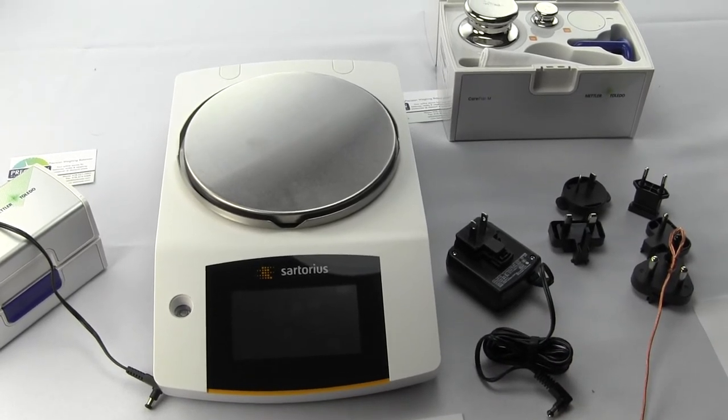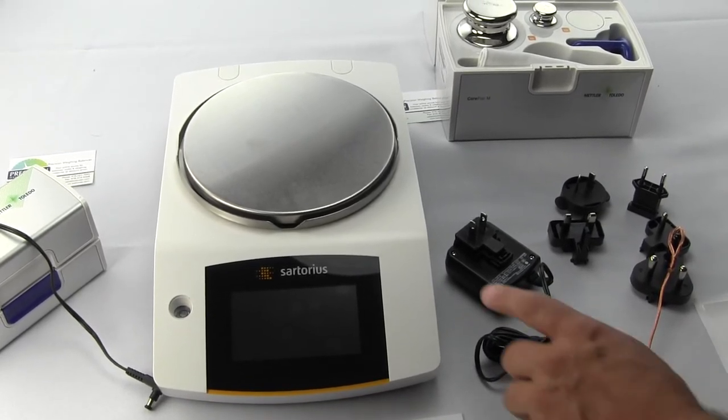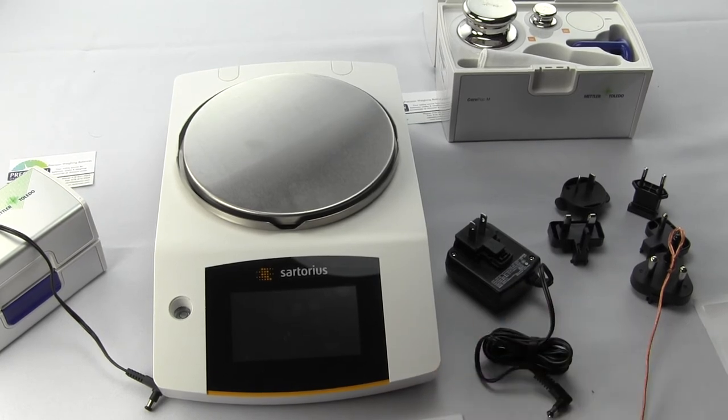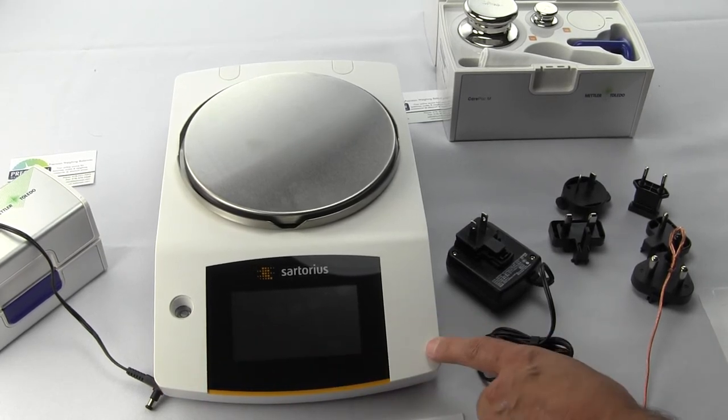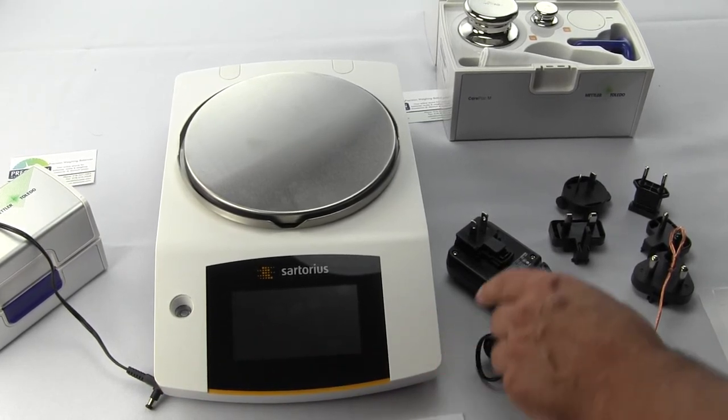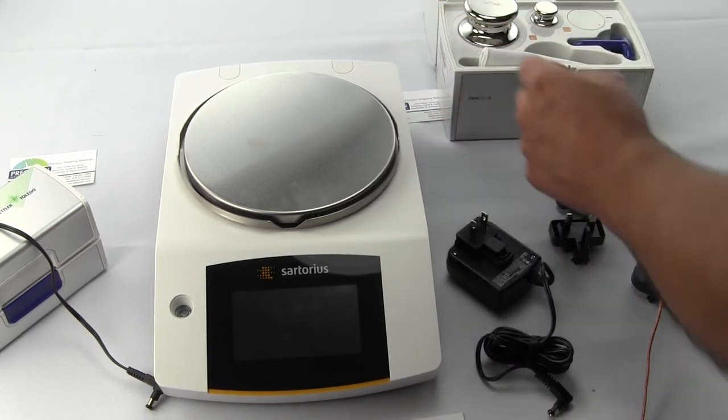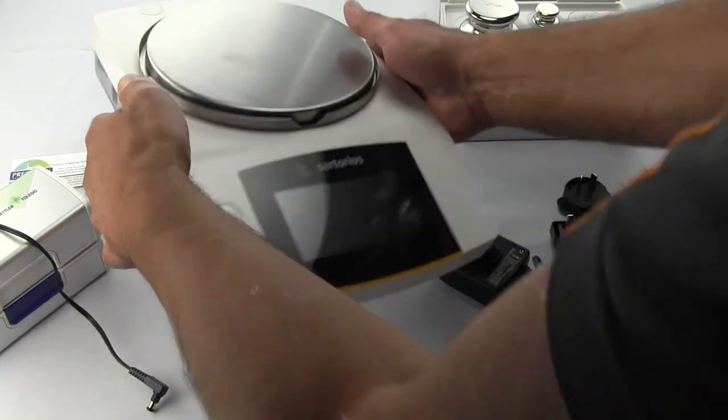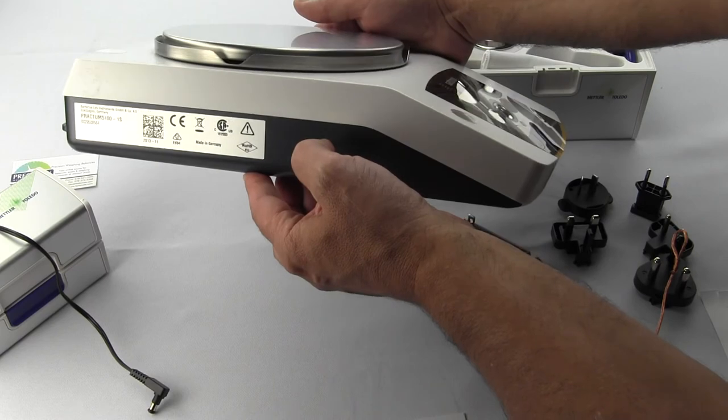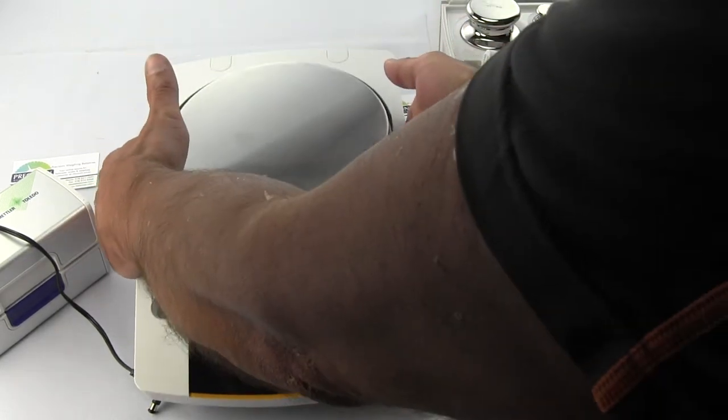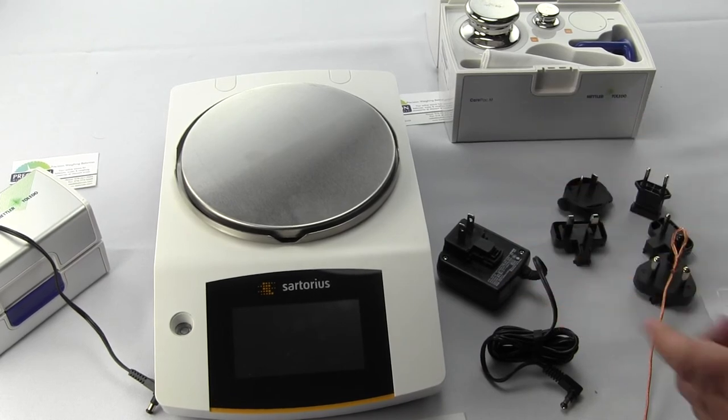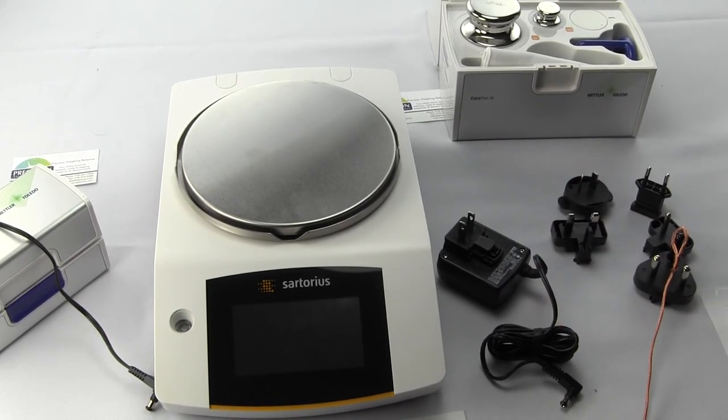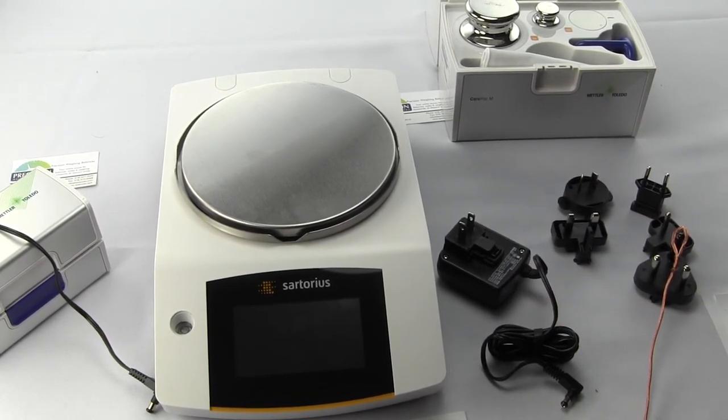The dimensions—this is all in the manual—but you're looking at 8.6 inches in width, 14.1 inches in depth, and 3.75 inches in height. For a lab it's a nice large footprint, but if you have very limited space this is something to consider before purchasing.